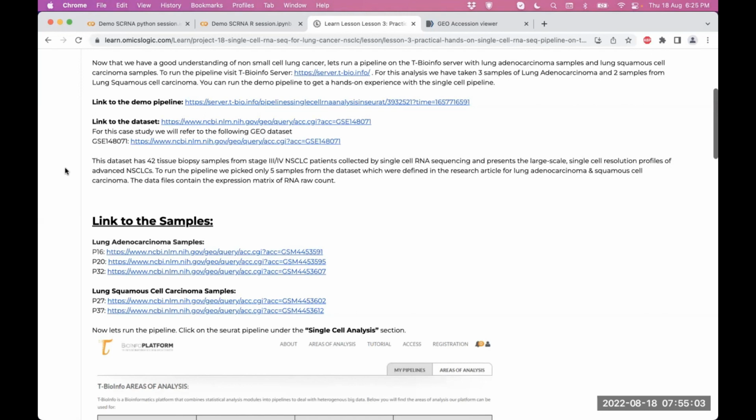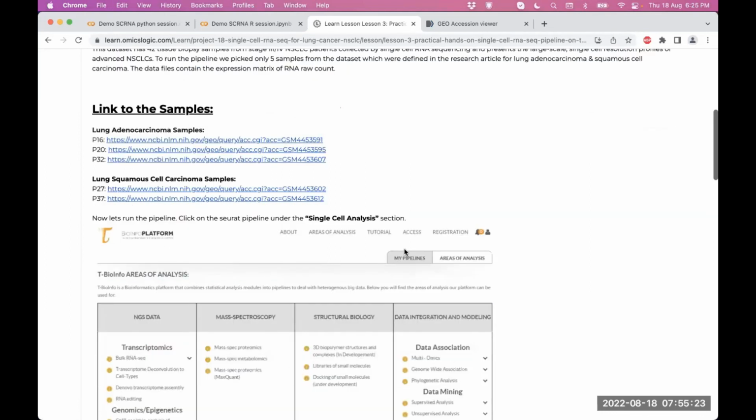Of course, you can select a completely different subset and identify if the comparison is actually valid, and if we get similar results to the original publication or not. Several different parameters define how you get to these results, and you will see that in a while.